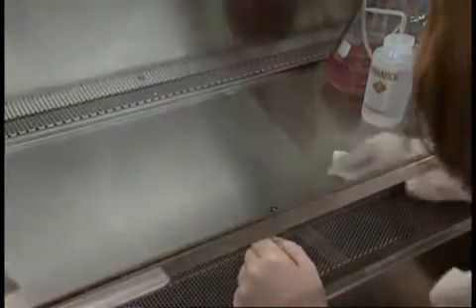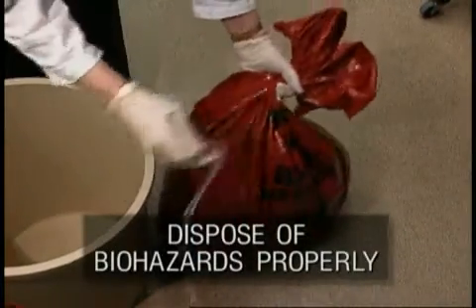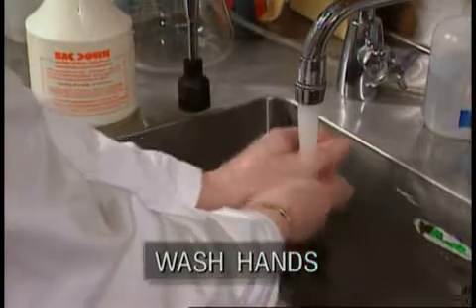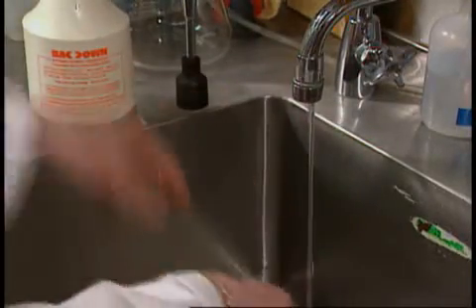Decontamination before the procedure protects the science. Afterwards, it protects the scientist. And proper disposal protects other workers. It's always important to wash your hands when completing a procedure and before leaving the lab.